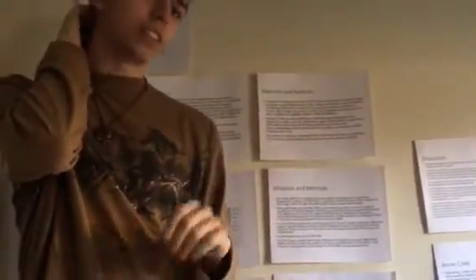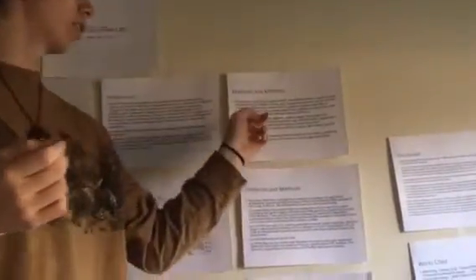Sample IDs 365 and 643 were two others that we compared. They were both German Shepherds. They had the same weight and sex, but differences in age, overall health, and supplements that they take. 365 takes coconut oil and 643 takes peanut butter treats and jerky. They also differ in that 643 is indoor and 365 is indoor and outdoor. Diet brand is also different, and 365 cohabits with a cat.